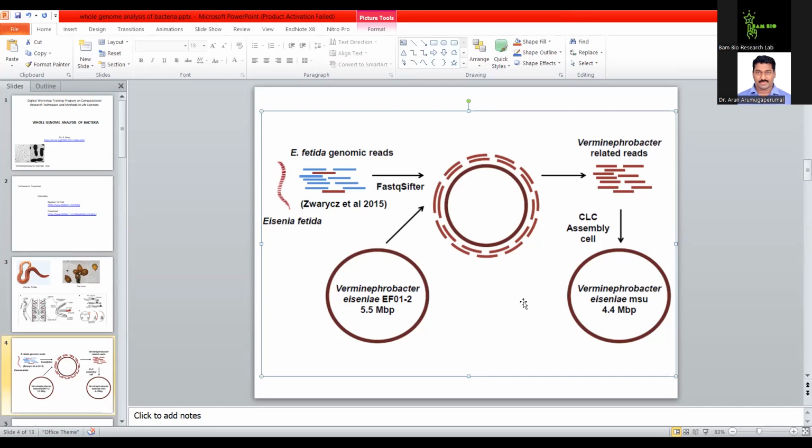I took the reads. Now for sequencing, this technology has some limitations. For example, this is 5.5 MB of single piece DNA, but you cannot give it as an input to a sequencing machine as such, because it cannot take 5.5 MB size of DNA. It can take only DNA of small pieces. So what scientists do is they take the DNA, randomly cut it into small pieces, and put those pieces into the input of a sequencing machine.